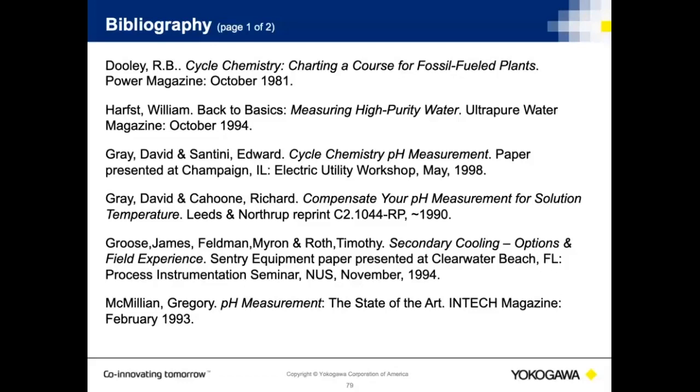But then you have to worry about, did you cool it consistently to the same value? And then you have to worry about, was there any of this issue associated with the solution temperature compensation? And that you really can't tell unless you do the test. And what was the test? The test is do the calculation for solution temperature compensation by measuring the pH at 2 different temperatures and see how great a value that is. If it's very minimal, then you can ignore it. If it's not, then you need to address it.